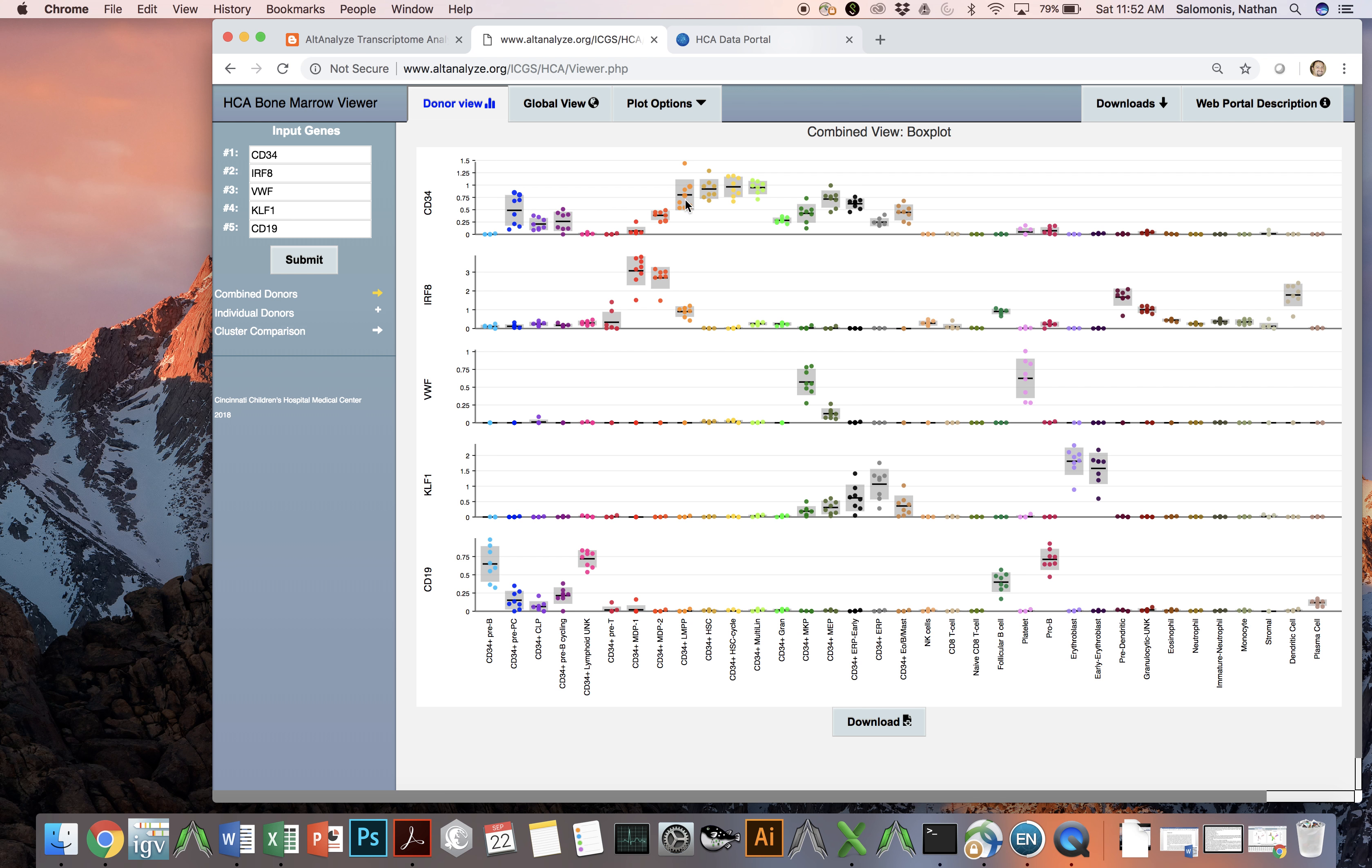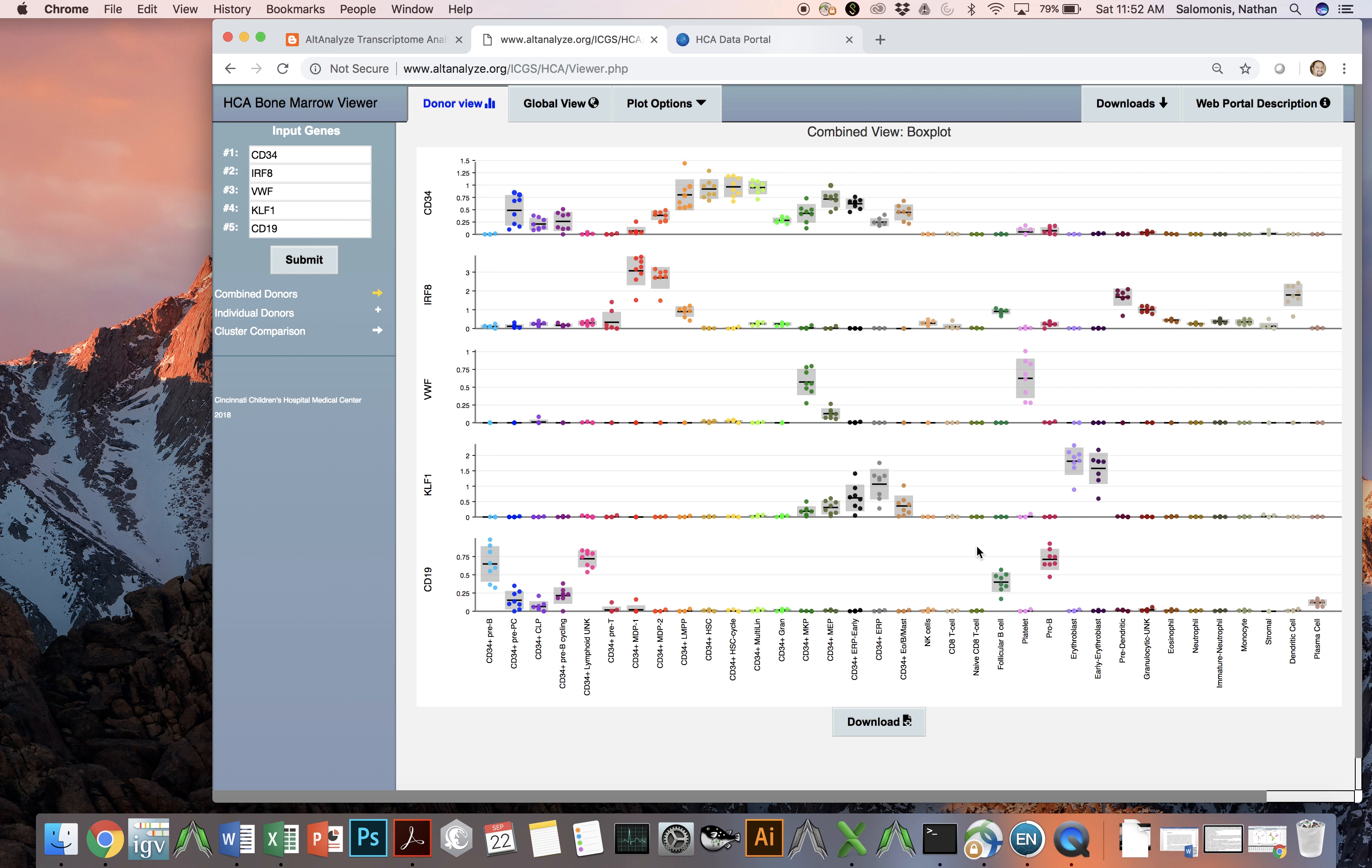The expression levels of each individual gene are shown here on average for the entire population of cells, in this case all 100,000 single cells, for all the populations indicated on the x-axis. You can change any one of these genes and view the profile of those genes within the context of all these cell populations.